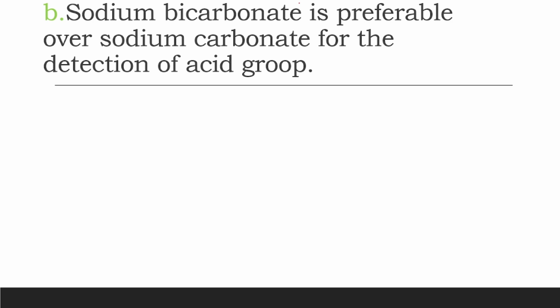Number 2, sodium bicarbonate, that is HCO3 minus, is preferable over sodium carbonate, that is CO3 2 minus, for the detection of acid group.